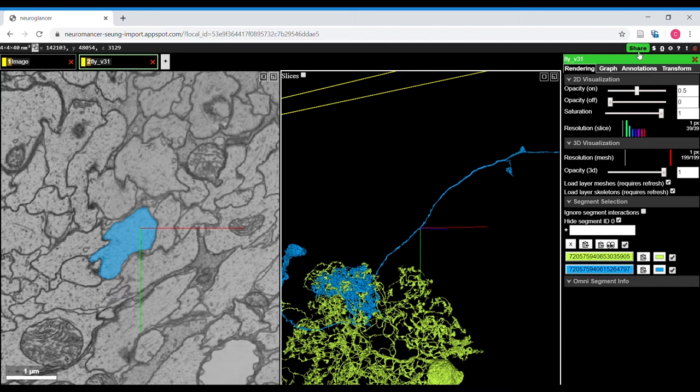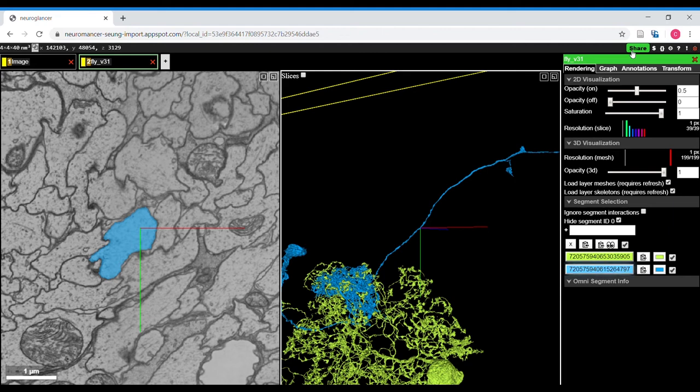And this share button also has the advantage of posting this state to the local memory so that if your browser crashes, then your state can be reloaded.